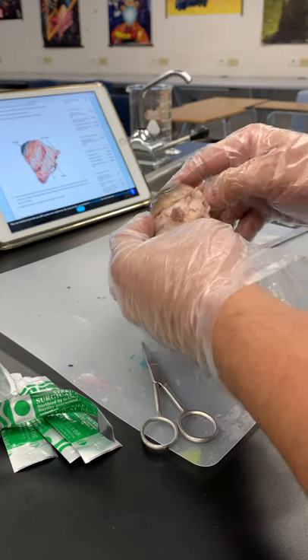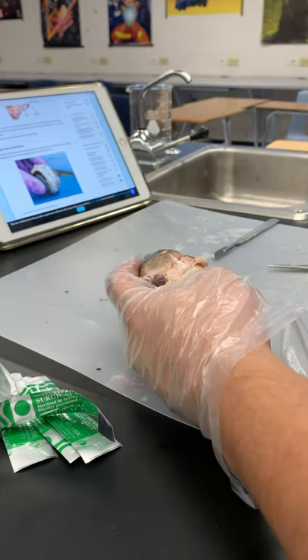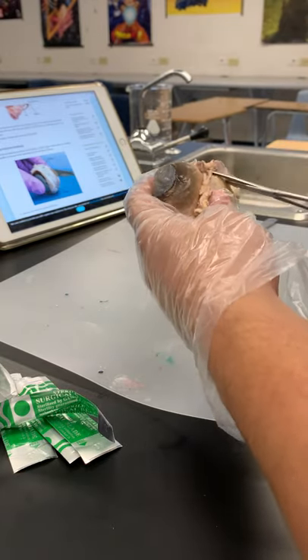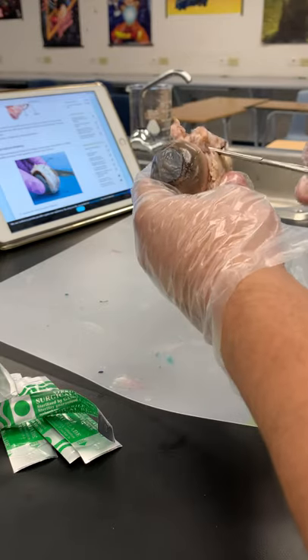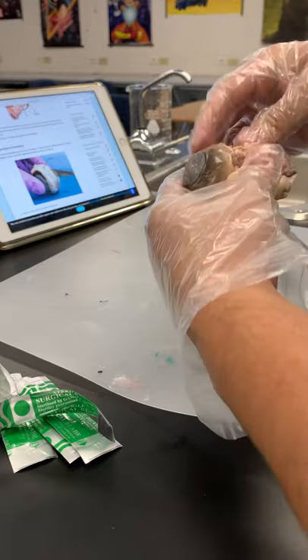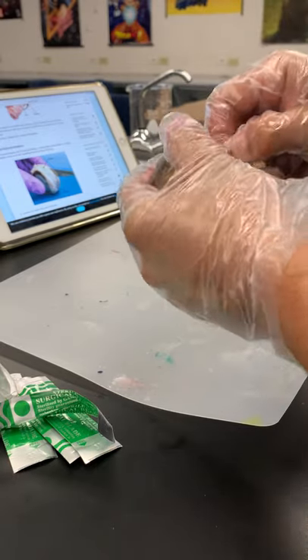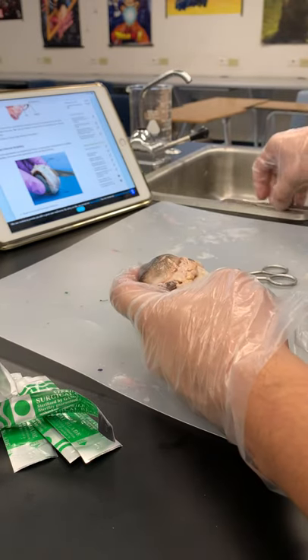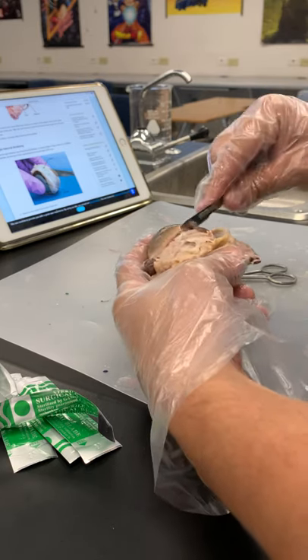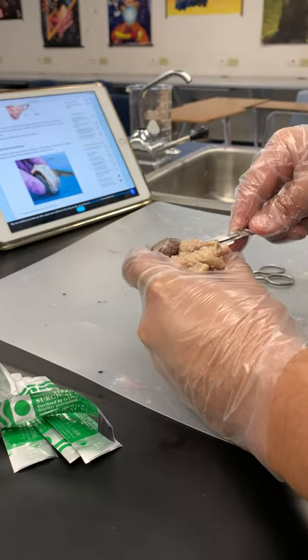I've got some fat out already. Trim the fat and muscle around the eye using scissors. We can kind of cut through a little bit. Scissors are pretty sharp, so be careful not to get into the eye too much. Be careful, don't get cut.